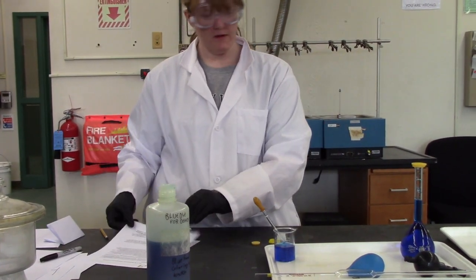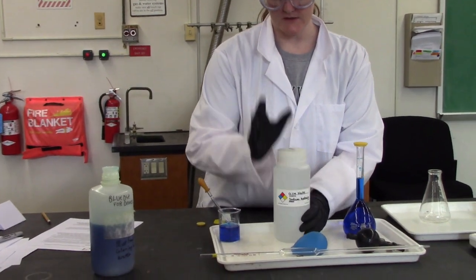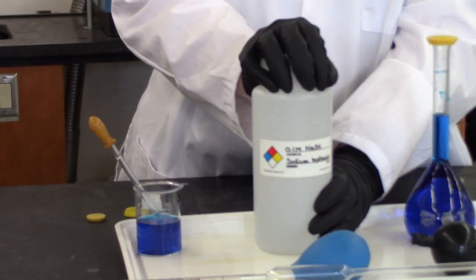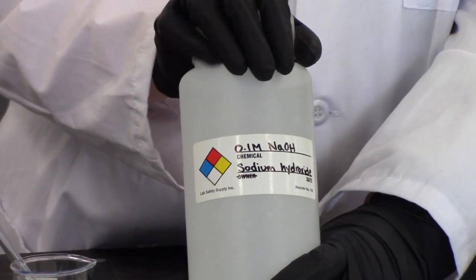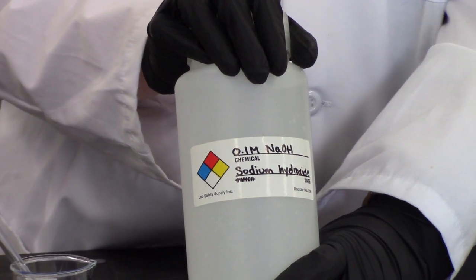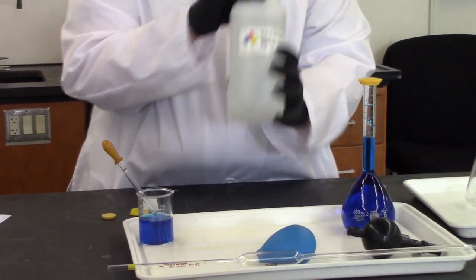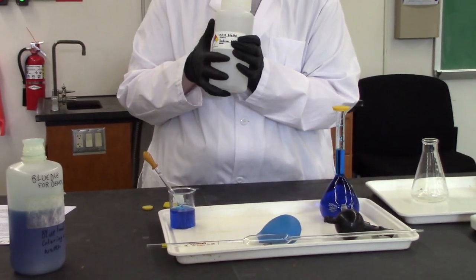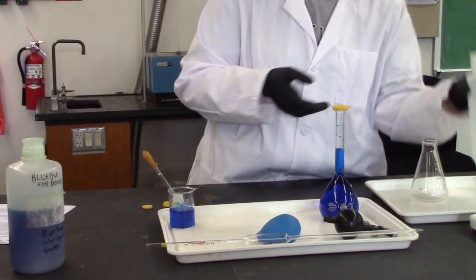In part two, we already produced the 0.1 molar NaOH. It used to be that we would make this in lab ourselves, but we found that people don't have time to do that, unfortunately, because it's a very helpful exercise. So our technician has made this for you already. If you have a version of the procedure that still has part two, preparation of sodium hydroxide solution, you can disregard that. It's already prepared for you. Again, these are stock bottles, though. Don't put anything into them because then everybody coming after you has a contaminated sample.